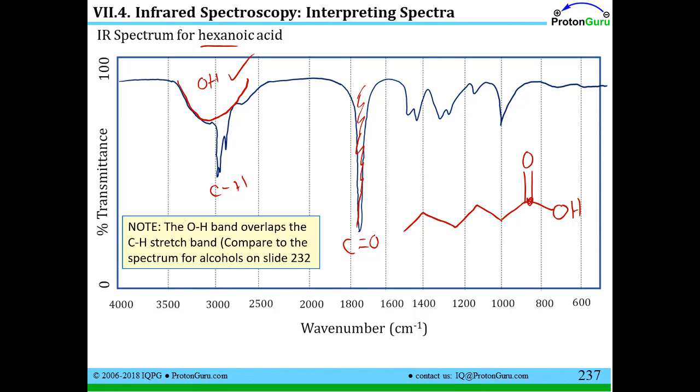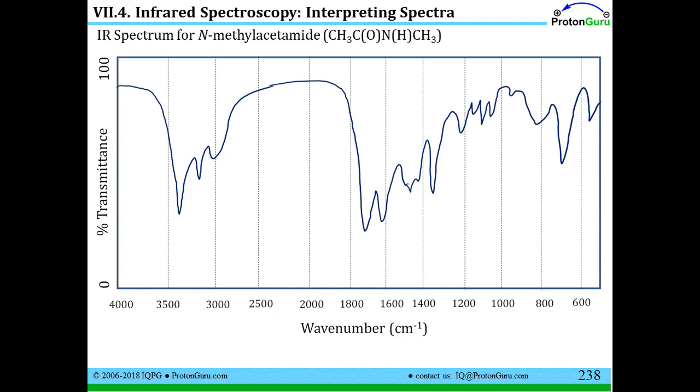This spectrum has some pretty large blob-looking peaks in it, but we can go through our progressions and figure this out. We usually see our typical CH stretches around 3000. We see that here. And we see this very sharp peak here. This seems to indicate an NH bond, not an NO bond, not an OH bond, which would be a broader shape. So an NH, we have a CH, and around 1700 we have a C double bond O. This is some type of amide with an NH group, and this particular molecule, if you draw out the structure from the condensed formula, would look like this.